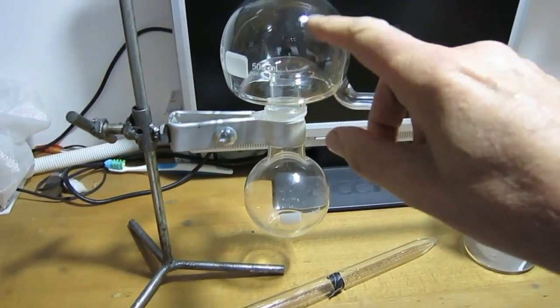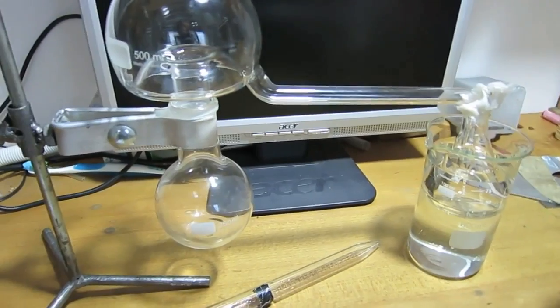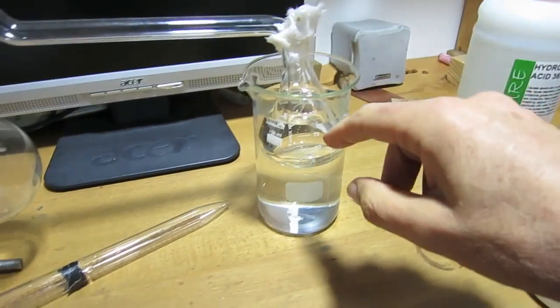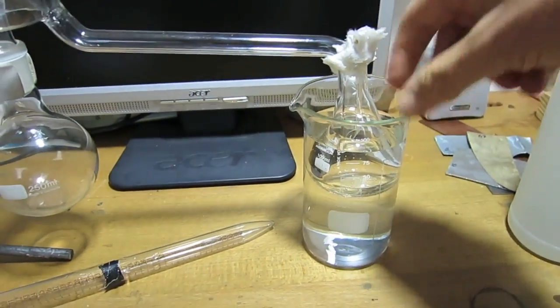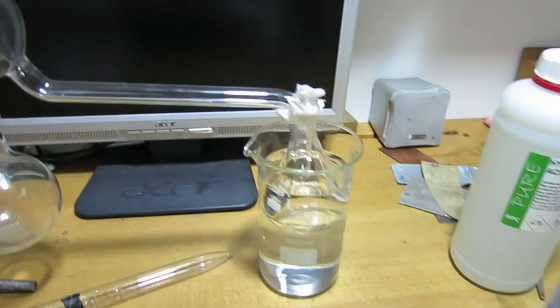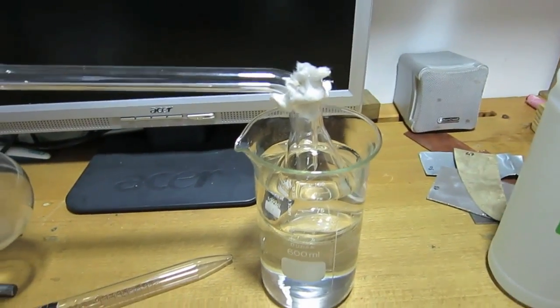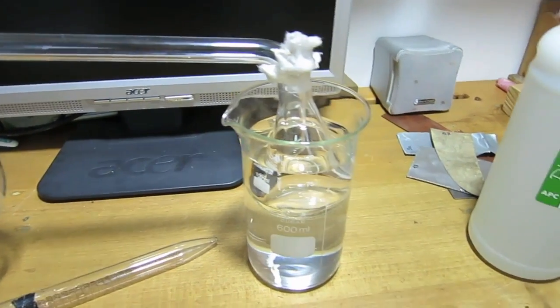will be vaporized. All the bromine vapor and some water vapor will condense here, but bromine has a lower boiling point, so the bromine will come here and come into this small Erlenmeyer flask. There should be lots of water here to cool the bromine. And I put some fiber. This is silica fiber for heating insulation. And this is resistant to bromine as well, to prevent evaporation of too much bromine.